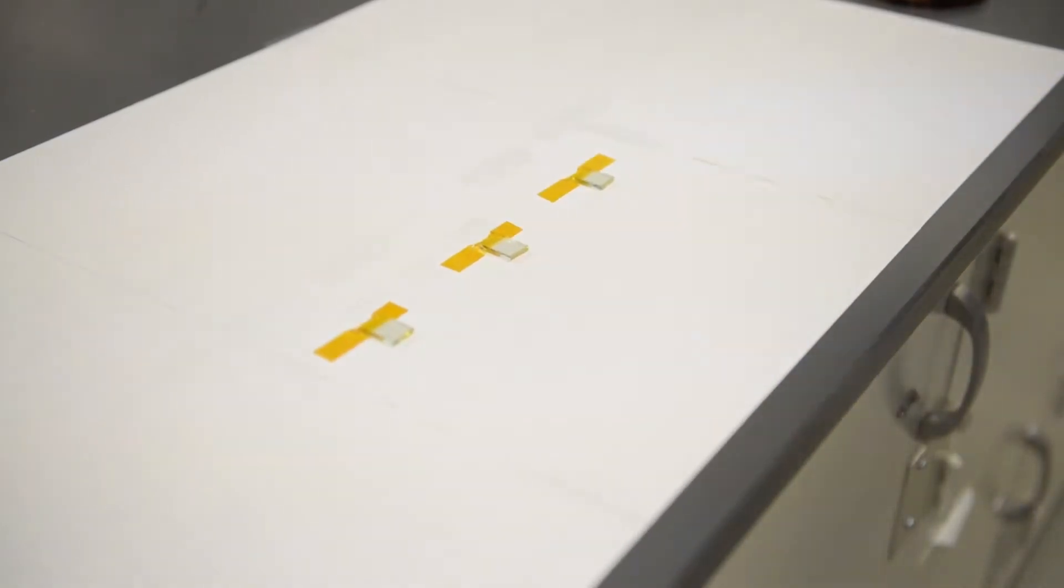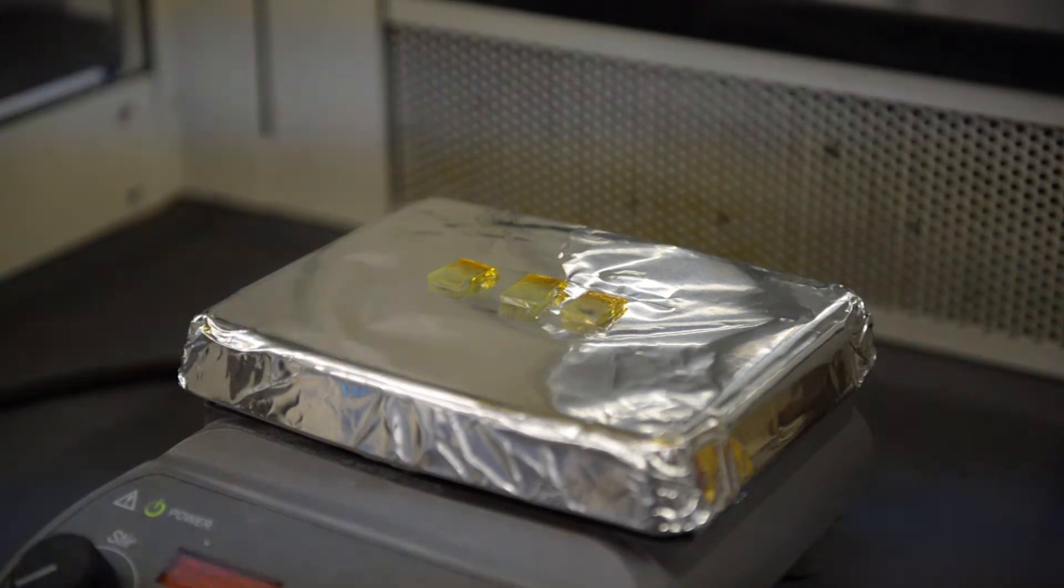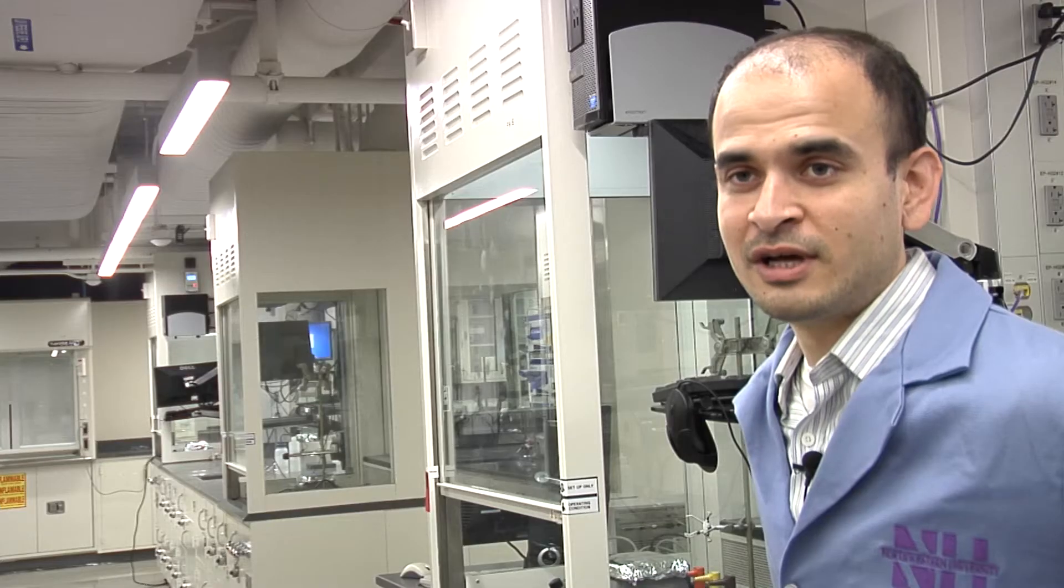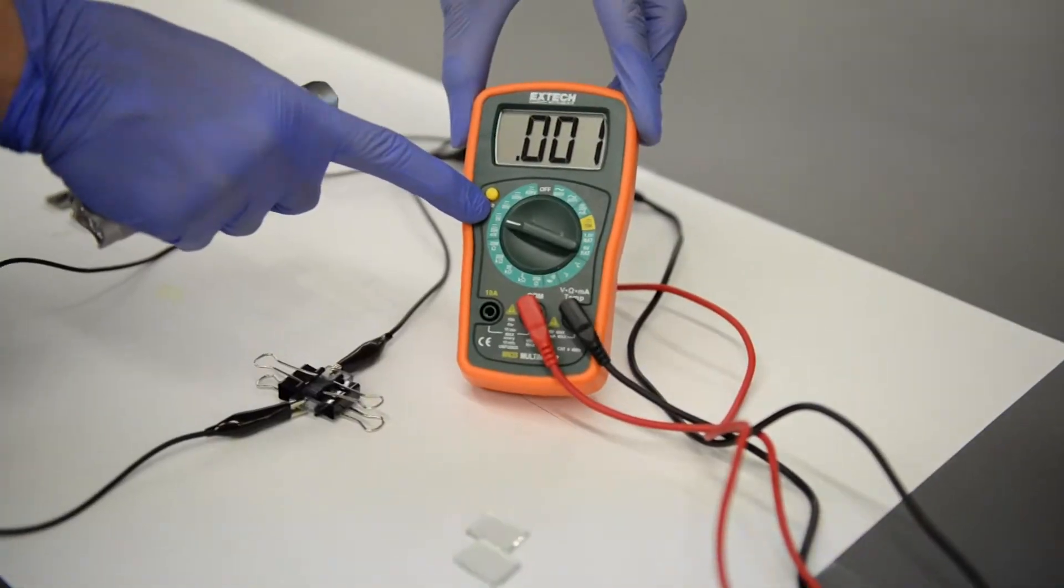So the key material is perovskite, a light absorbing material, and it's a very simple sandwich design. At the end of it, you have a solar cell, and you can measure current and voltage coming out of it to show that it's converting sunlight into electricity.